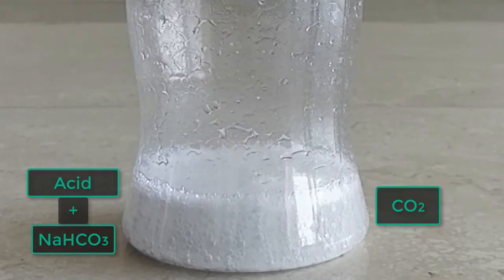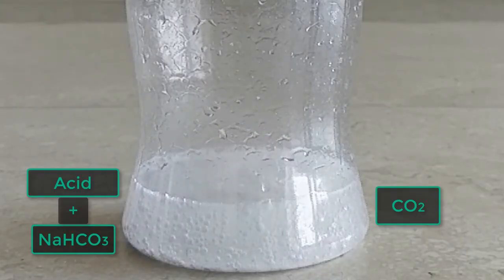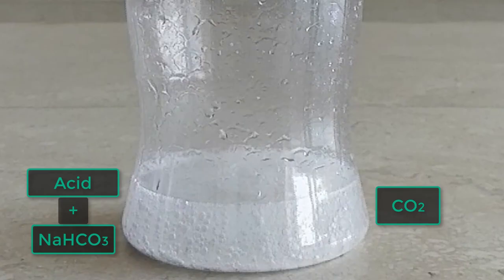But wait, how do we experimentally verify that this gas is carbon dioxide gas? Because see, this gas does not have any peculiar color. This does not have any peculiar smell also. And we know that there are many gases that are colorless and odorless, like hydrogen, oxygen, nitrogen. All of these gases are colorless and odorless and they are around us, right? So how do I experimentally verify that this particular gas is carbon dioxide?